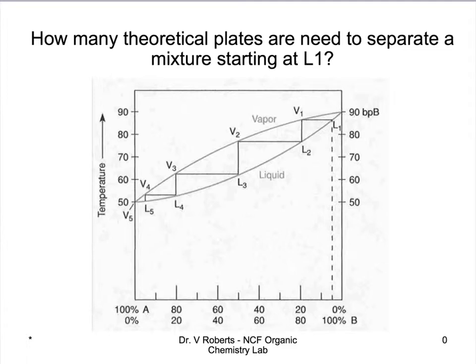Is there a rubber in here? You're right, a rubber, an O-ring, yeah. Okay, so go ahead and take it apart. And we want it to be hooked up with a hot plate. And we're using one of these.